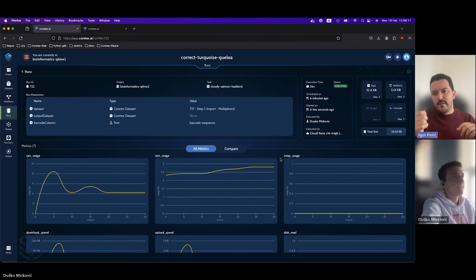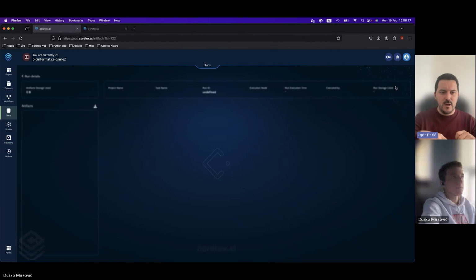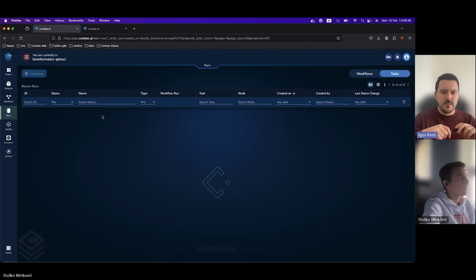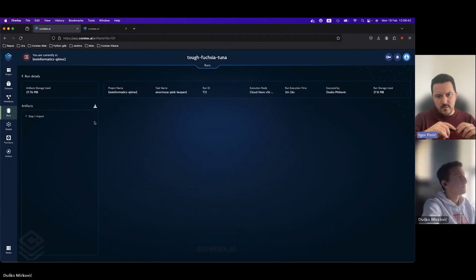That's cool. And can we check artifacts very briefly? So we are in a second step already, but let's see. I think that they are dumped anyways at the beginning. Yeah, we do have some artifacts right here. So it's an archive here. And so we can see the demultiplexed content. Can we briefly go to the step one artifacts and just see how that went? What was generated there? So it's the imported versions of those.